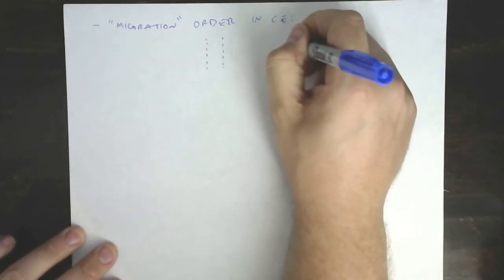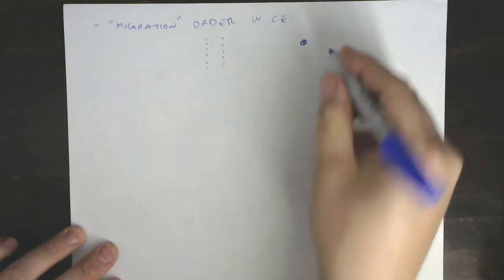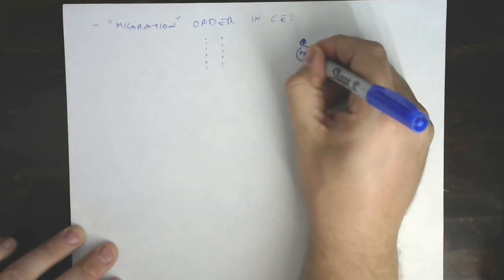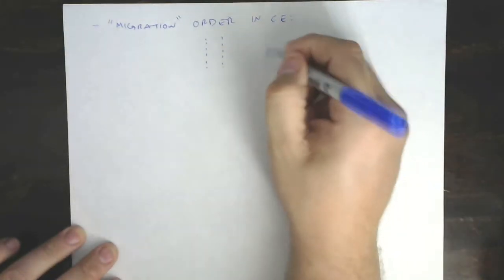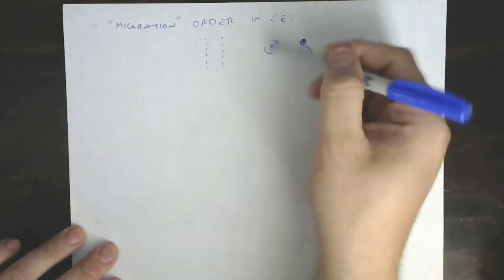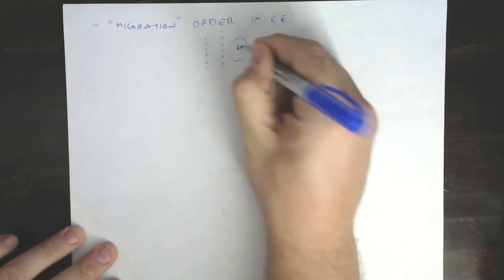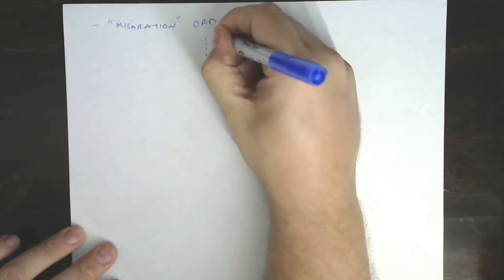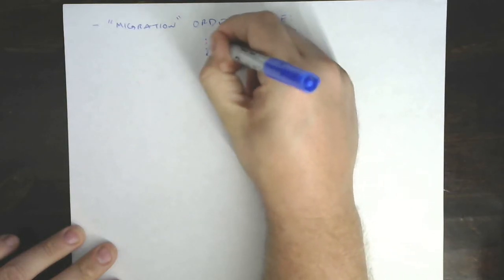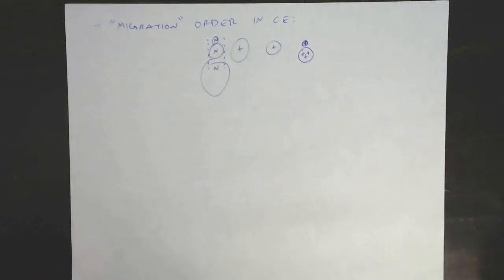I'm going to get kind of a feel for how this works. So way out in front here, the fastest stuff is going to be small, or it's going to have a high charge, right? So let's look at that. Something that's slightly larger, but it has 3+ charges. Okay, so it's going to be smaller. It's going to be highly charged. We're going to see our moderate sized. We're going to just normalize all this to 1 charge. Let's assume everything has 1 charge in it. Then the bigger it gets, the closer it gets to where it started. Okay, we've also talked about how neutrals all have an electrophoretic mobility of 0. So it doesn't matter the size of these things. None of them are moving at any different velocity than just the velocity of that injected plug.